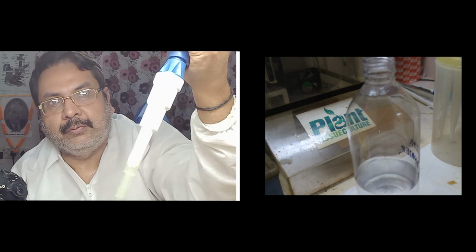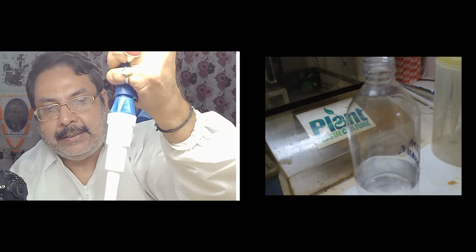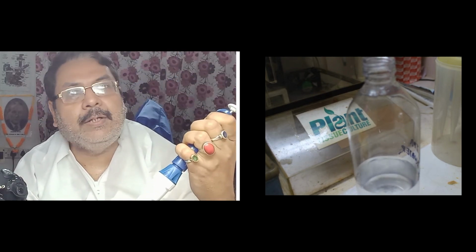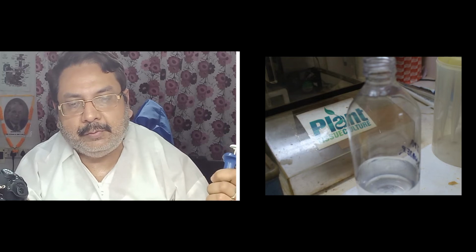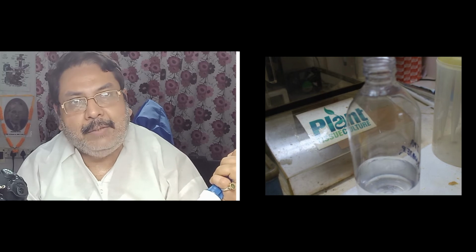So the liquid is up. But here one thing is there: there is no automatic release. This auto release button is not there. So you have to release by your hand. This auto pipette does not contain any tip release plunger, because this is a very big tip. So you have to remove it by your hand. This is the only difference between the two auto pipettes.